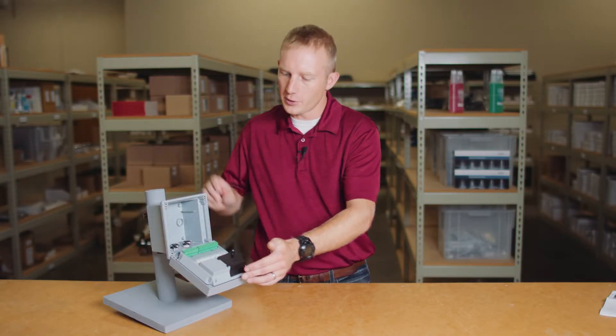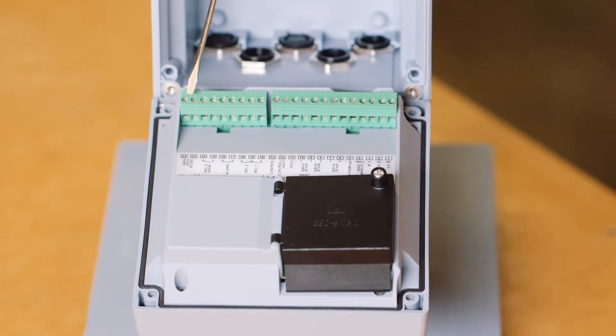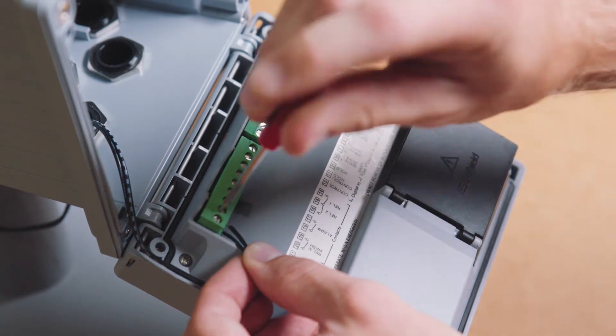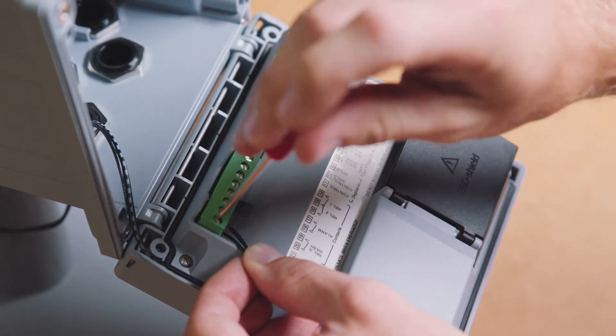Reviewing the terminal block, you'll see that your power supply connects here on the main rail. The Stratus Evo utilizes a universal power supply and can be powered anywhere from 24V DC up to 230V AC. A convenient feature of the transmitter is that it's polarity insensitive, so either terminal can be used for connection of the positive and negative wires.